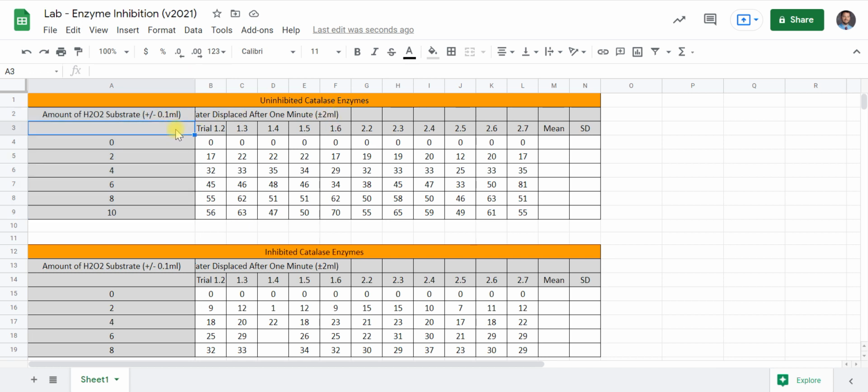And we want to get rid of any extra cells. This cell is kind of a placeholder for this row here. So I'm going to click these two cells and highlight them. And I'm going to come here to the merge icon again and merge them together. But I want to get it fitted in the center. And so then I'm going to come up to this here and pick vertically align and go to the middle one here. I should vertically align it. Now we have that nice and neat.